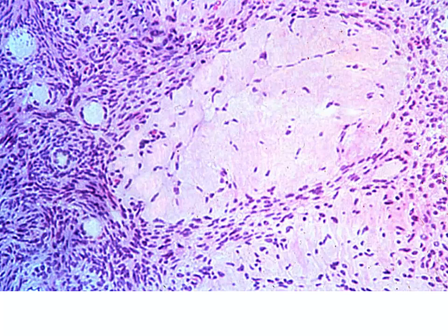In this one, again, we're looking at a corpus albicans. We don't really see the highly folded nature that's typical of what we see with a corpus luteum, and in that case, a lot more stromal tissue type material that we see here. And so quite small in nature as well. So we're going to go with corpus albicans for this particular one.